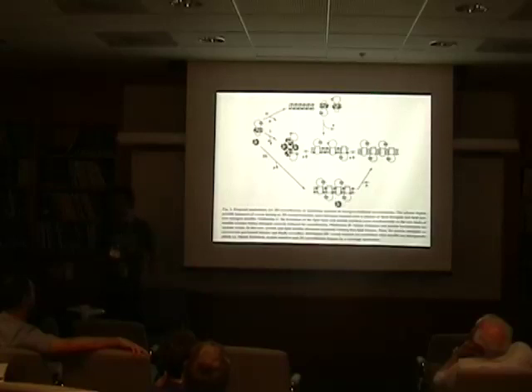on the other side. So this makes sense to me, but what I don't understand is that it still takes a long time until you reach the CMC, and during that whole time, it can still mix. You're absolutely right. That's why, in my opinion, in most cases, if dialysis works when you mix solubilized lipid and protein, it's because the time of incubation is very low. So how much time do you think it takes to get this mixture?